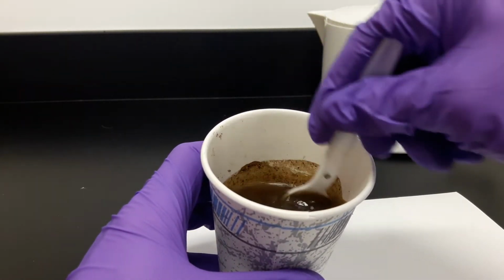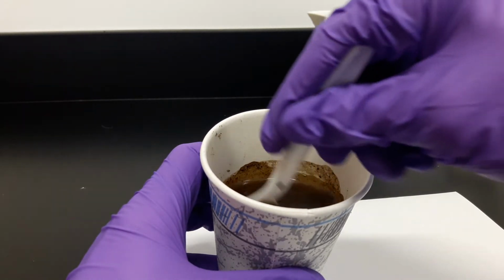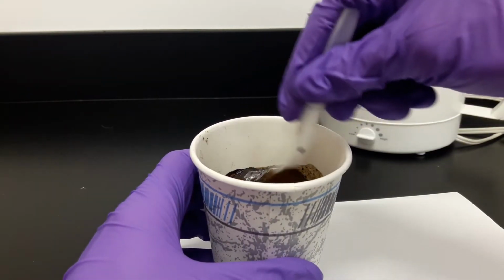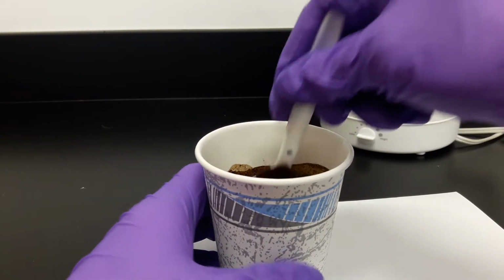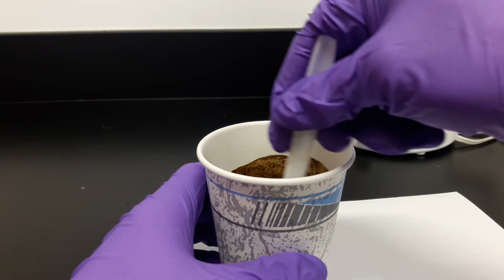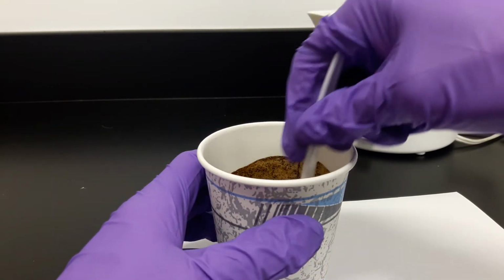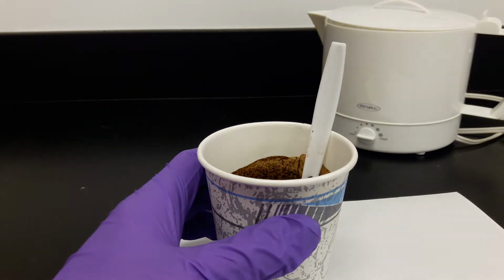Now, as we're stirring, the water, because it's hot, is going to be loosening the oil from the sand. And as we keep stirring, more and more of that sand is going to get cleaned of oil, and the oil is going to be suspended in the hot water solution. So we're just going to clean this for approximately 2 minutes or so, with gentle stirring, trying not to spill, because of course it's very sticky and would make a big mess.